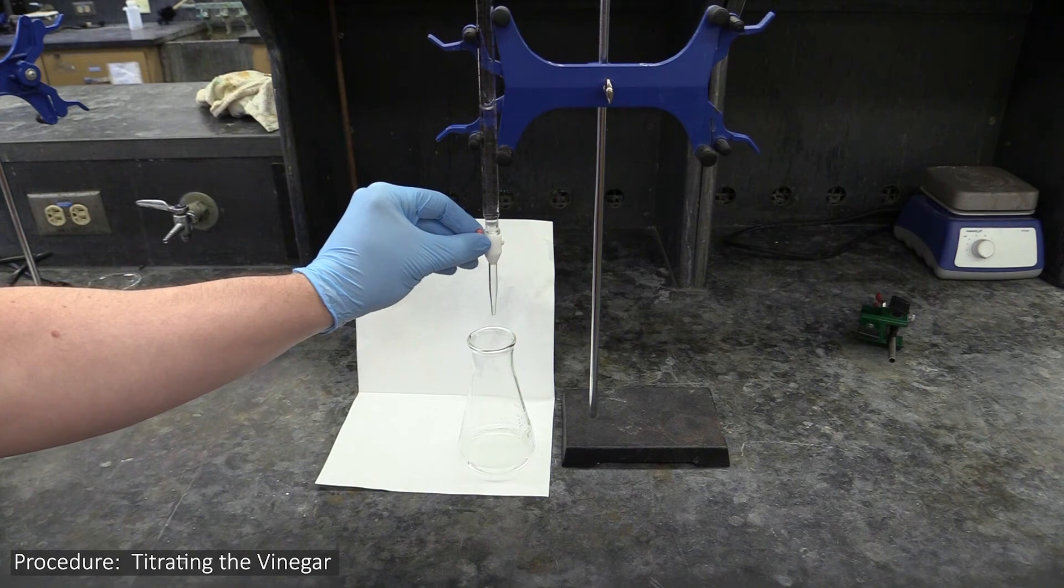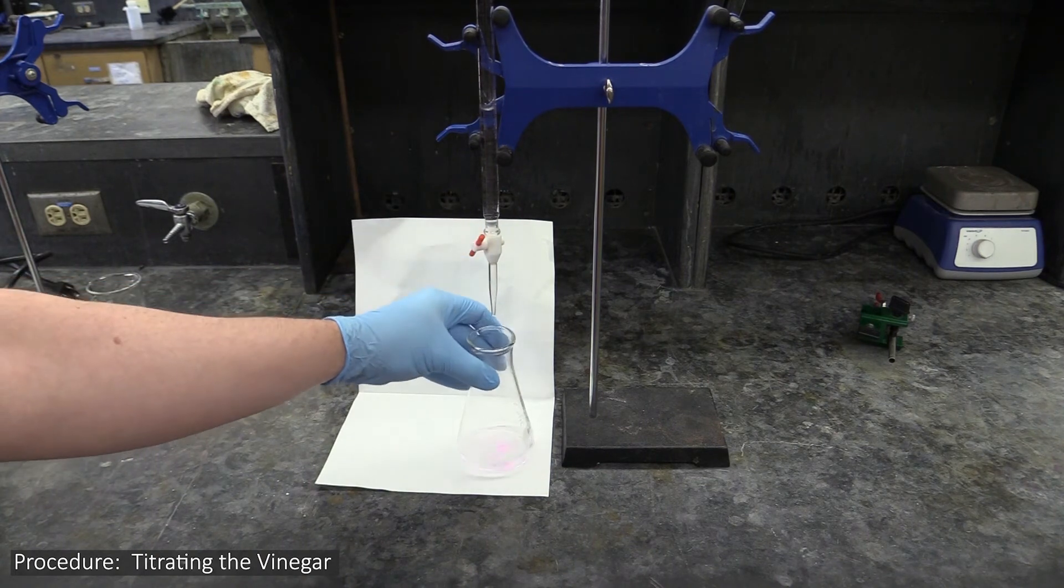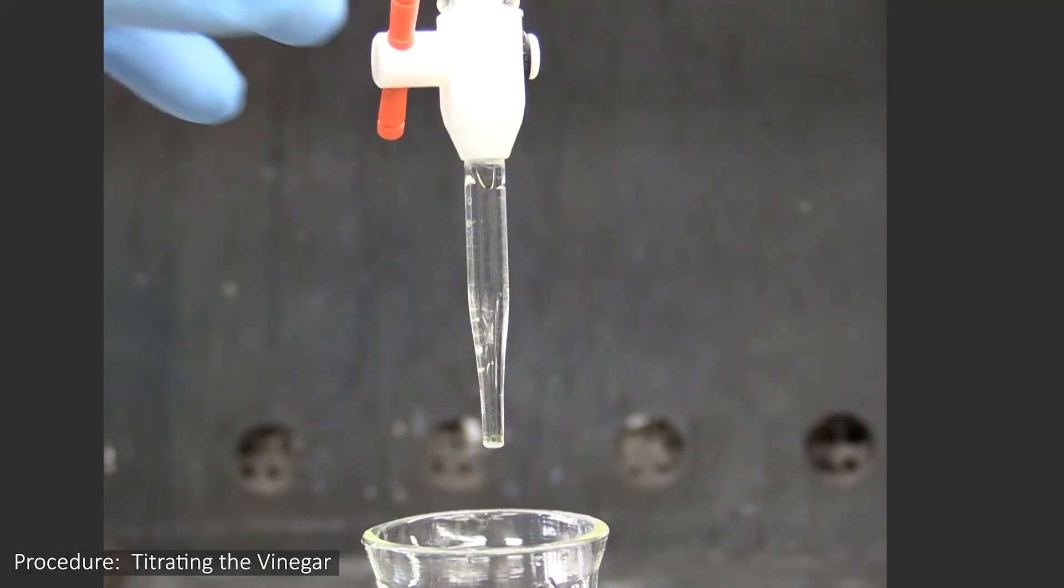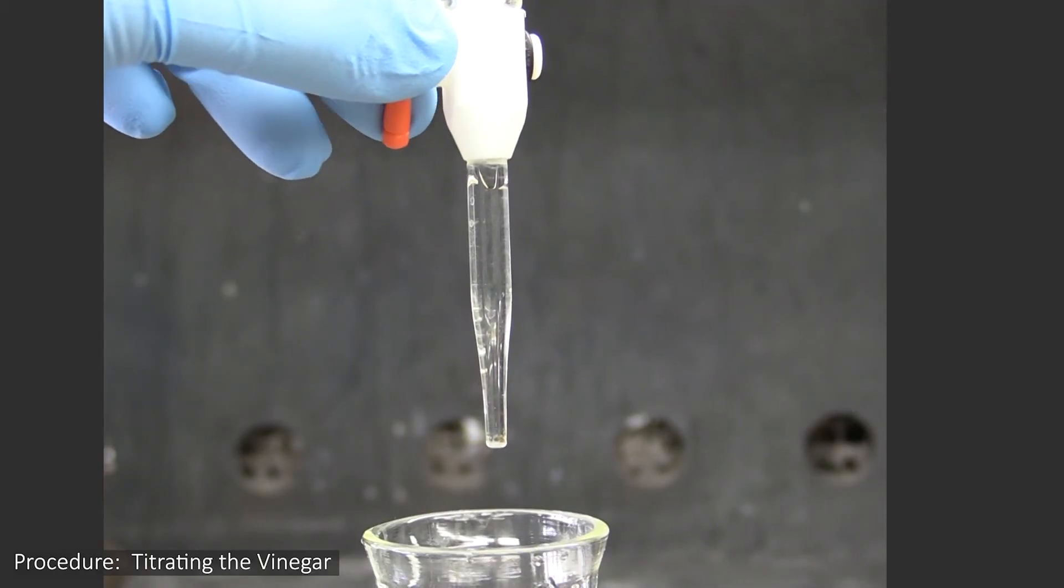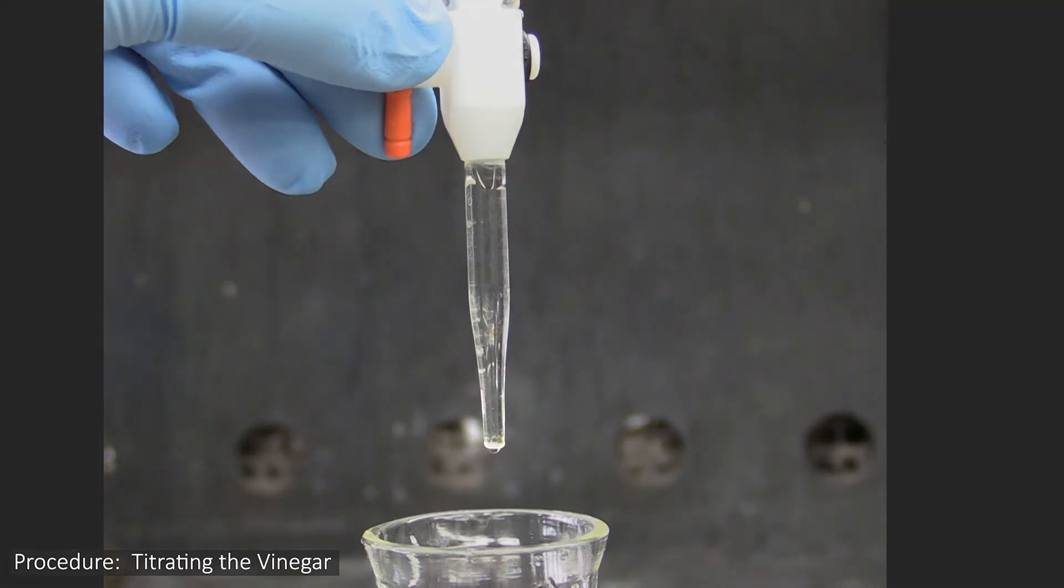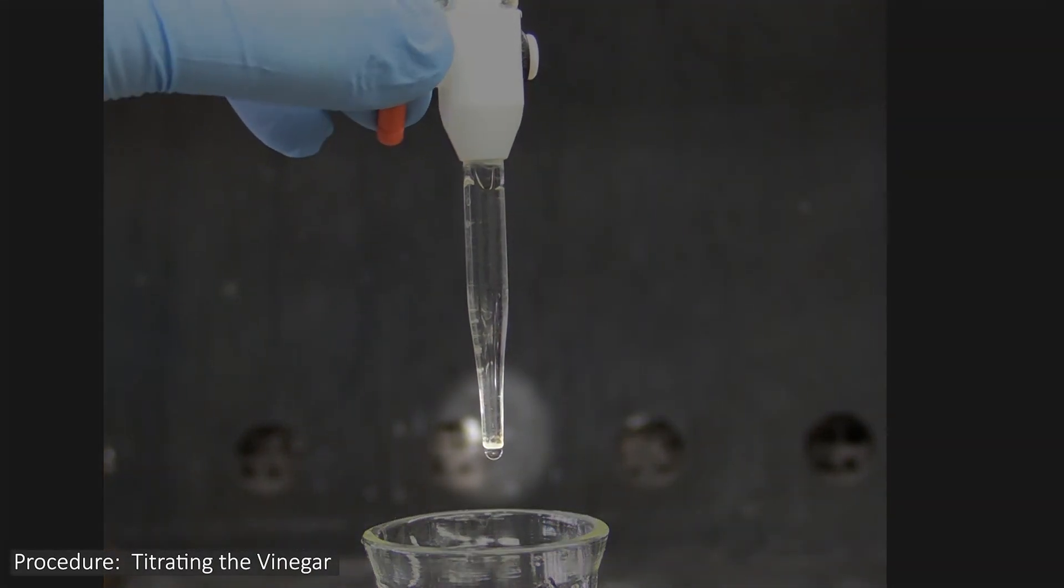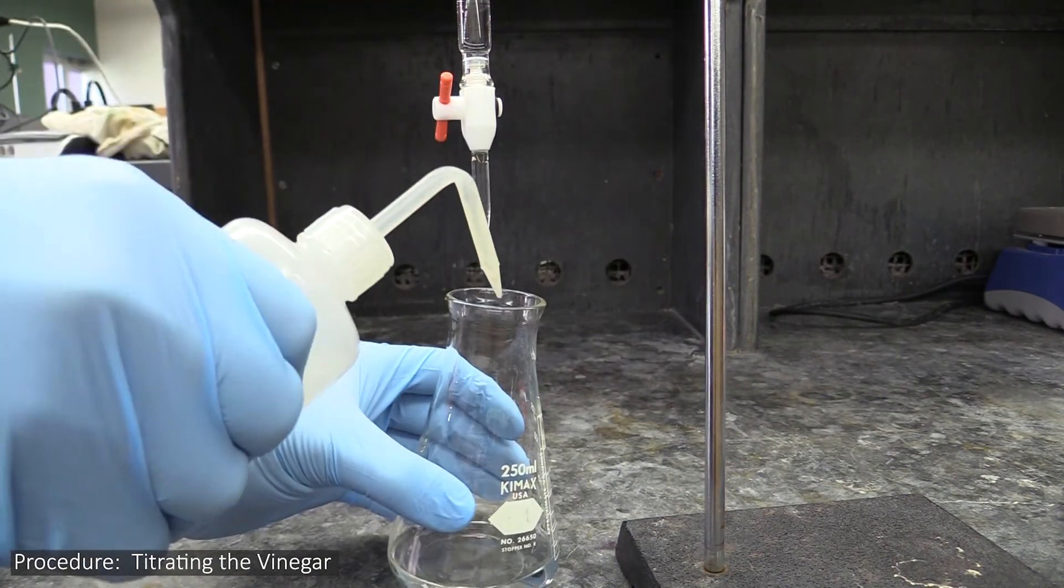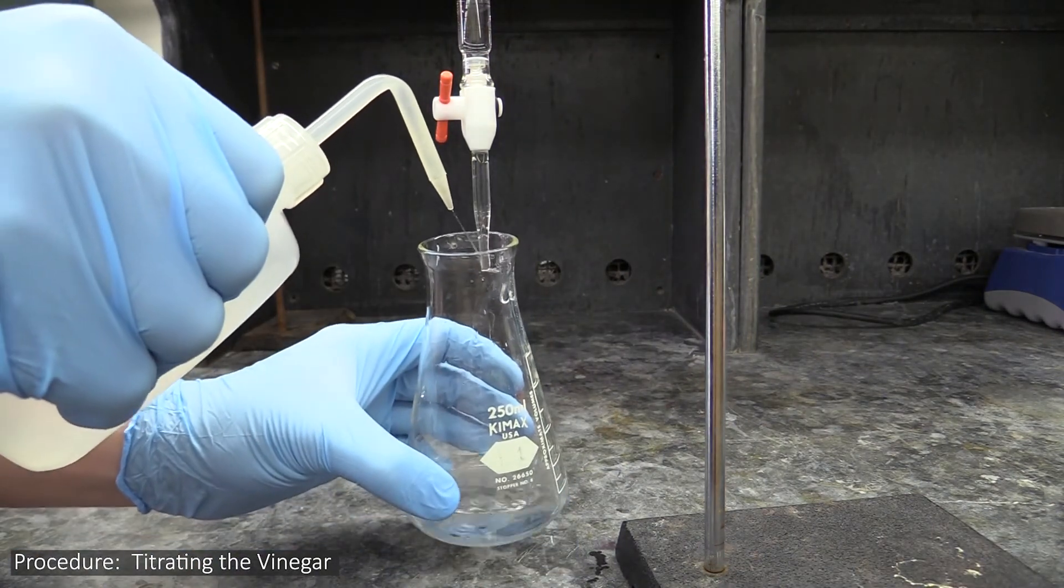Unfortunately, if you are very close to the endpoint, even adding just one full drop can cause it to overshoot. To avoid this, you will probably have to add the last little bit of titrant by slowly opening the valve until a half drop forms on the tip. To get this half drop into your flask, you can either touch it to the flask's inside and wash it down, or use your wash bottle to spray it off.